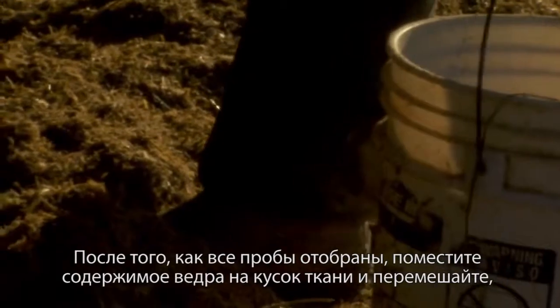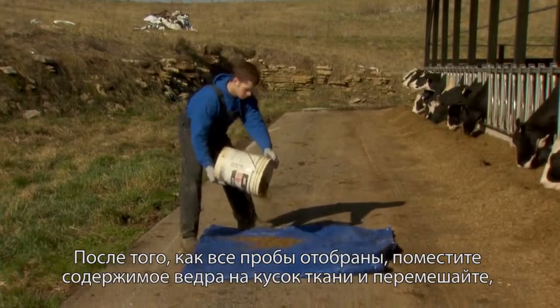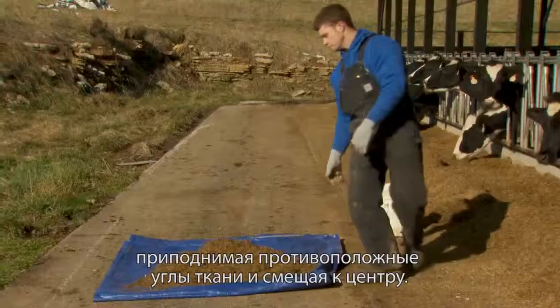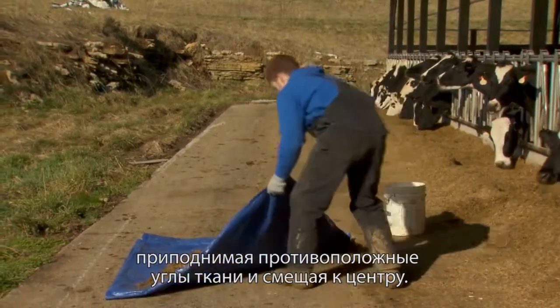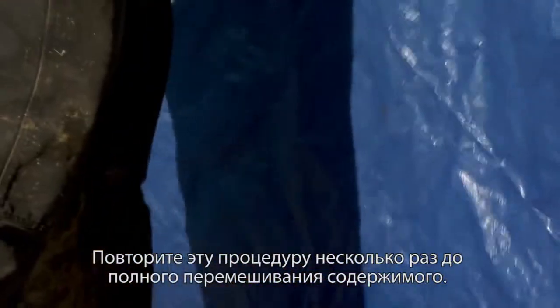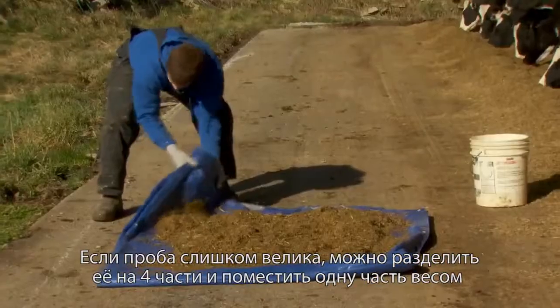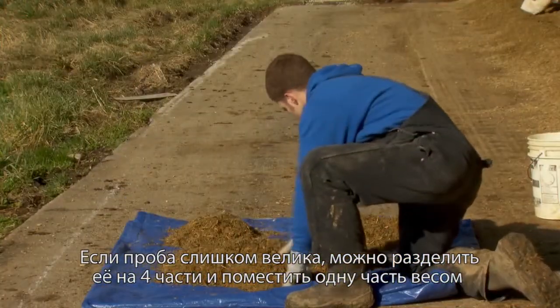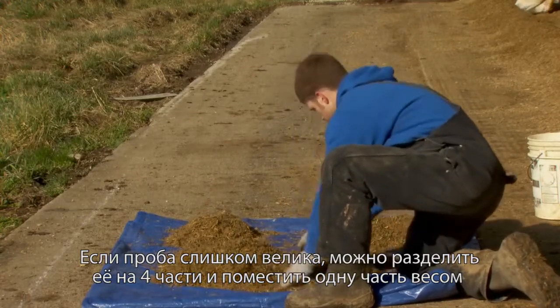Once you've collected all your samples, transfer the contents of the bucket onto a tarp. Mix gently by picking up opposite corners of the tarp and bringing into the center. Repeat this action several times until the contents are thoroughly mixed. Since this full amount is too large of a sample to send in for sampling, quarter the contents and separate.